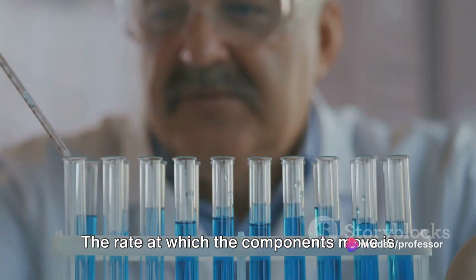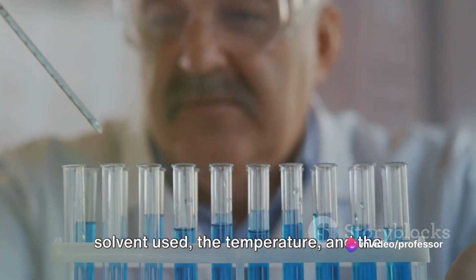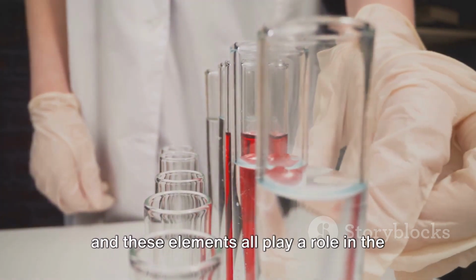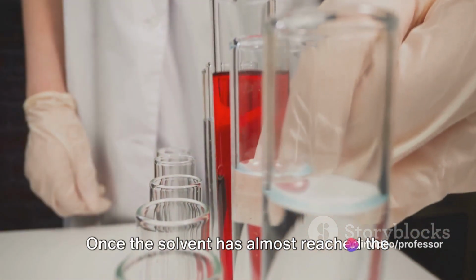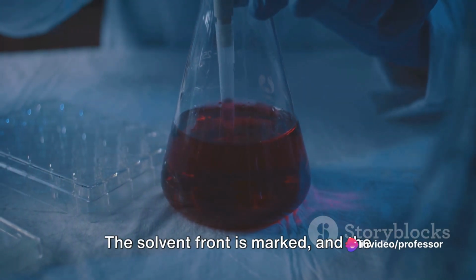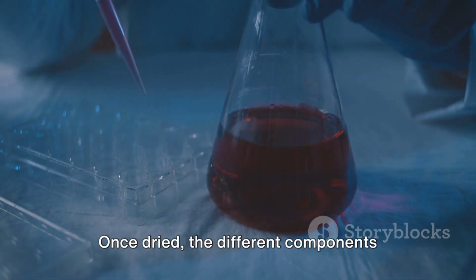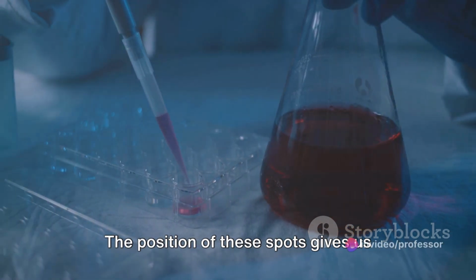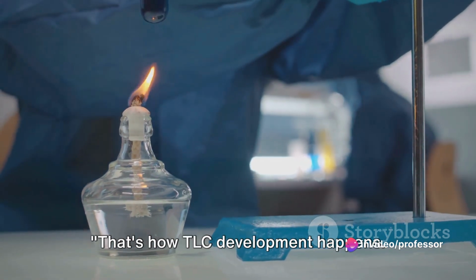The rate at which the components move is influenced by a few factors: the nature of the adsorbent, the type of solvent used, the temperature, and the specific interactions between the sample and these elements all play a role in the dance of separation. Once the solvent has almost reached the top of the plate, we remove the plate from the chamber. The solvent front is marked, and the plate is allowed to dry. Once dried, the different components appear as spots on the plate. The position of these spots gives us valuable information about the sample, but that's a story for the next scene.